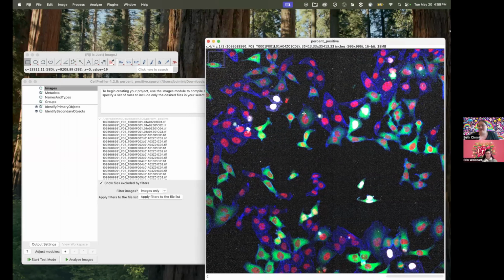And we have some cells that have one, and some cells that have the other, and some cells that have both. I'm sure for the biologists in question, it is super important to know mostly about what are the cells that have both. So we'll make both single positives and then the double positive. And then I'll quickly show what happens when you want to do this with speckles.